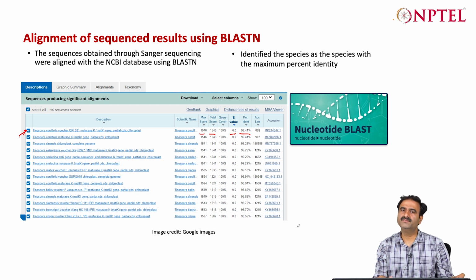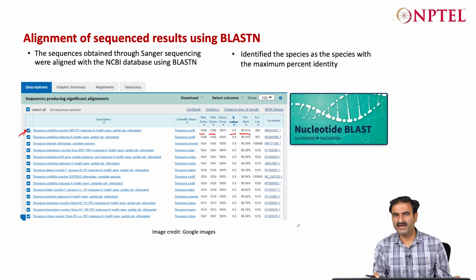Then, along with the morphological confirmation, if you can get the correct or desired hit for some of the markers, you can confirm that the species is correct. But mostly, one of the marker sequences should already be in the database, submitted by someone, and you can confirm by aligning against that. So NCBI is important that way, and NCBI BLAST is usually done for this purpose.